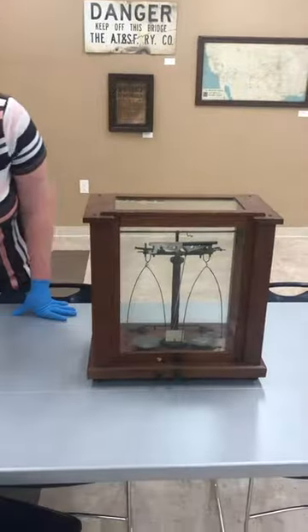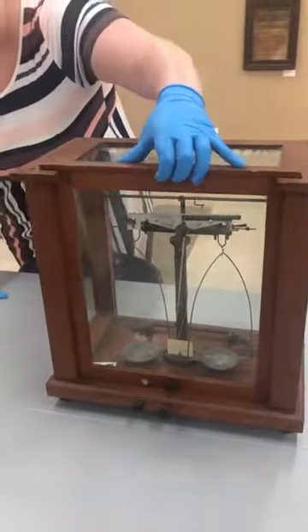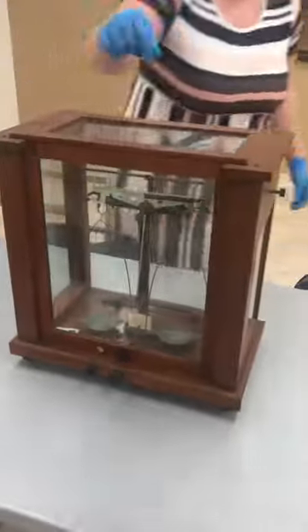It only measures up to about 200 grams. You would place a brass weight on the left pan and then whatever sample you're trying to measure on the right pan, and then you would compare the difference to tell the weight. There's a rider across the top that would measure the small differences in mass. This part would open up so you'd place the weights and the sample in, but then you wouldn't use any of the instruments by hand.